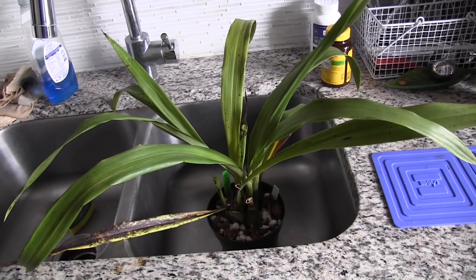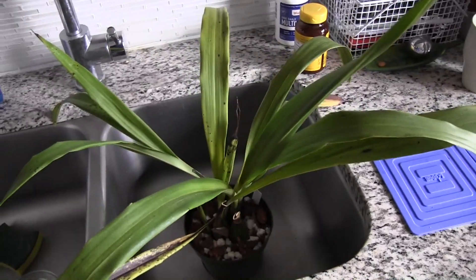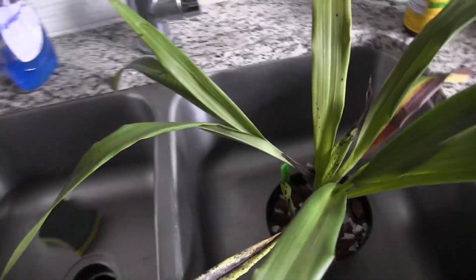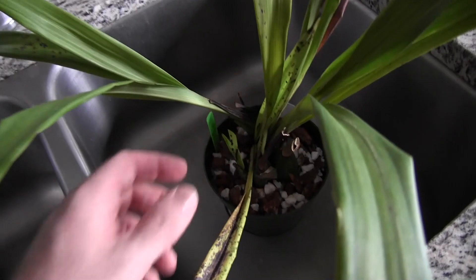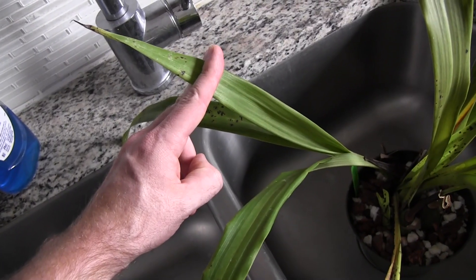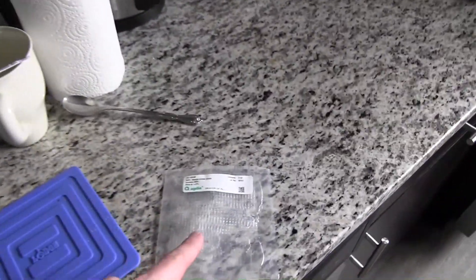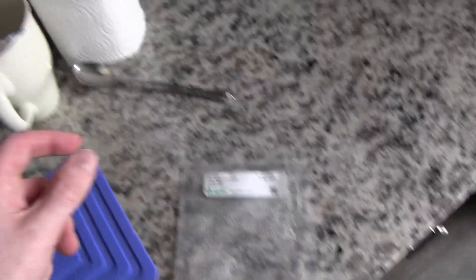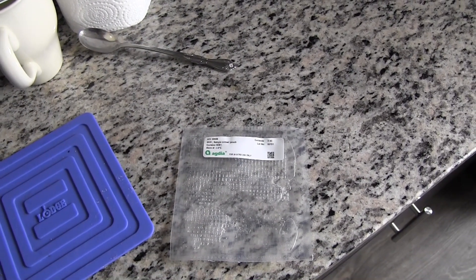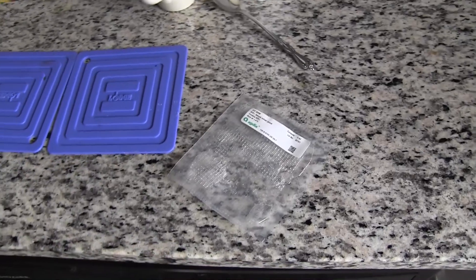But before I introduce this plant to my collection, I am going to virus test it. I'm going to take a piece of one of these leaves, preferably one of the newer leaves, and then grind it up in the bag of solution here. Then the test strip will go in there and we will see if this plant is virus free — at least for the two viruses that this specific test tests for.